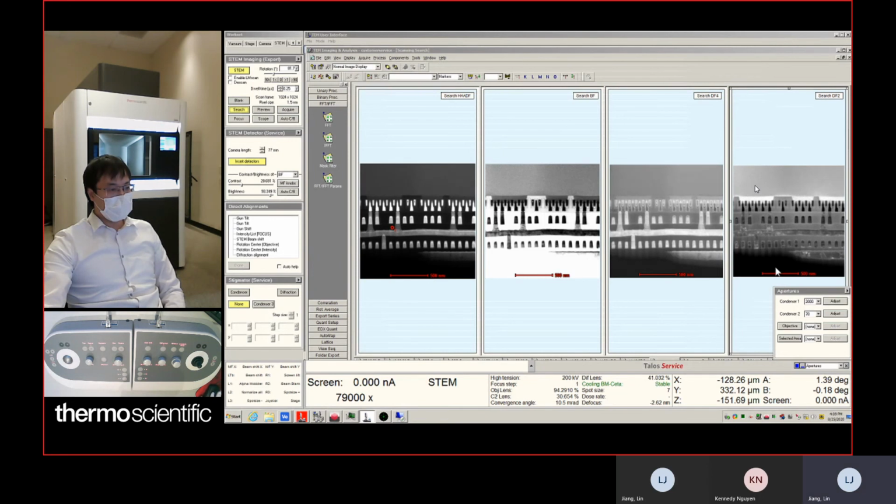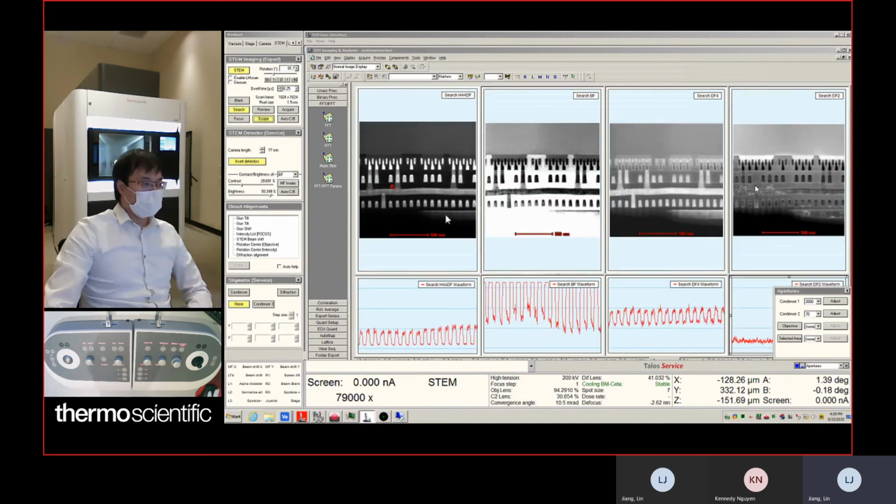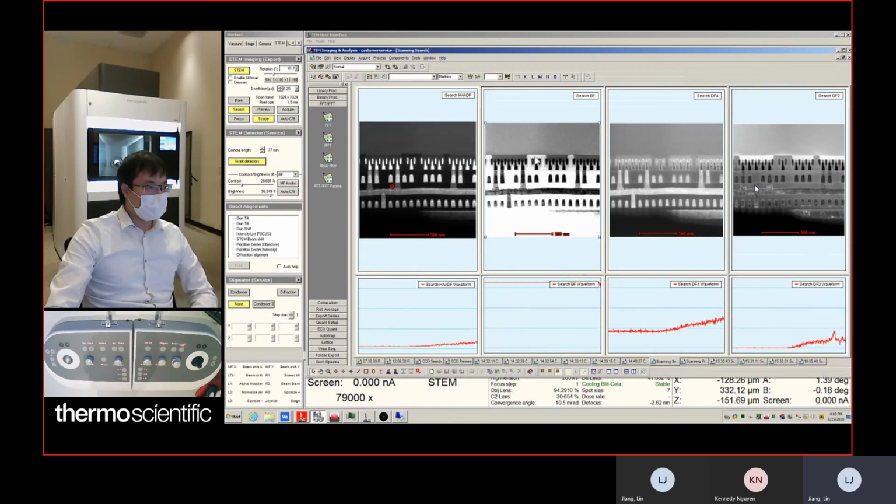We can judge that by taking a look at the vacuum. Your vacuum looks dark, but in the bright field, your contrast is inverse. Your vacuum looks bright. So we can adjust the contrast by using the scope tool. So contrast for HAADF is good. For the bright field, we can set up bright field by using the mouse, clicking dark, bright field, and then we can.